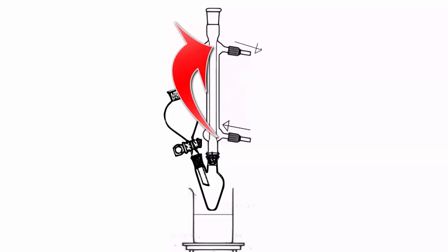Remember water should always be pumped uphill in terms of condensers, so the water should enter at the bottom and leave at the top. At this stage you would probably already have your first reactant together with any solvent or catalyst that might be required.